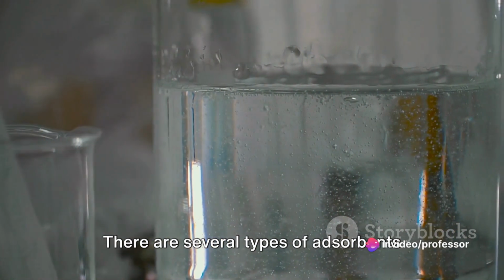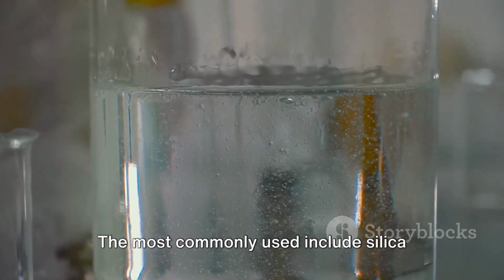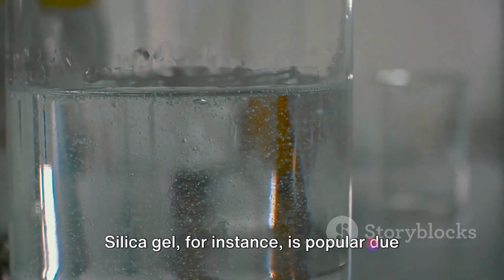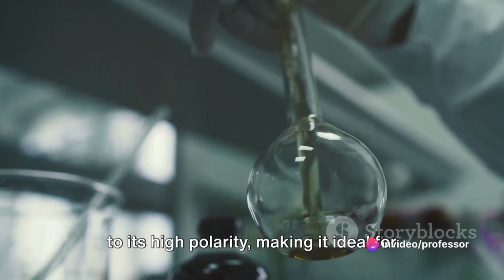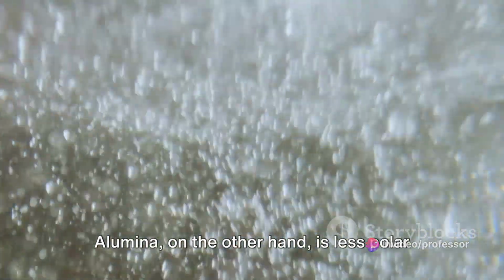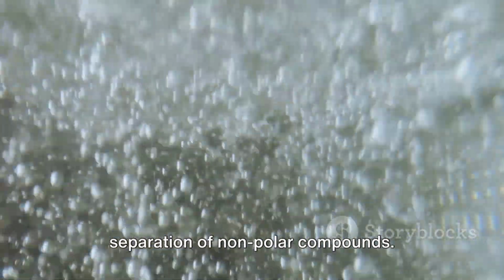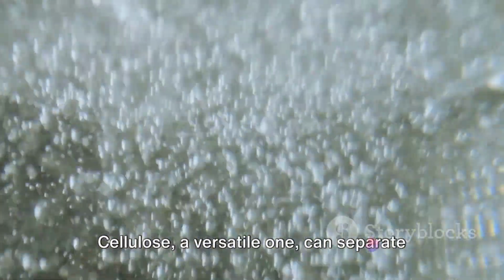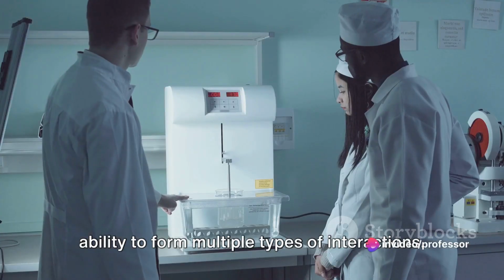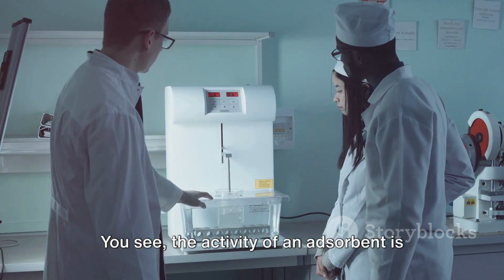There are several types of adsorbents used in TLC, each with its unique properties. The most commonly used include silica gel, alumina, and cellulose. Silica gel, for instance, is popular due to its high polarity, making it ideal for separating polar compounds. Alumina, on the other hand, is less polar than silica gel and is often used for the separation of non-polar compounds. Cellulose, a versatile one, can separate a wide range of compounds due to its ability to form multiple types of interactions. Now let's delve into the activity of these adsorbents.